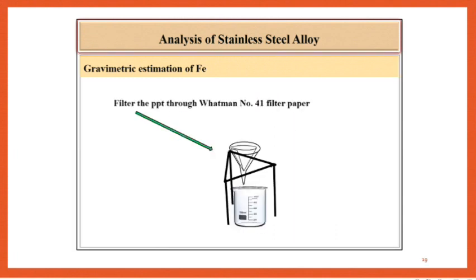Filter the precipitate of Fe(OH)3 through Whatman No. 41 filter paper. The filtrate is yellow due to formation of Na2CrO4.